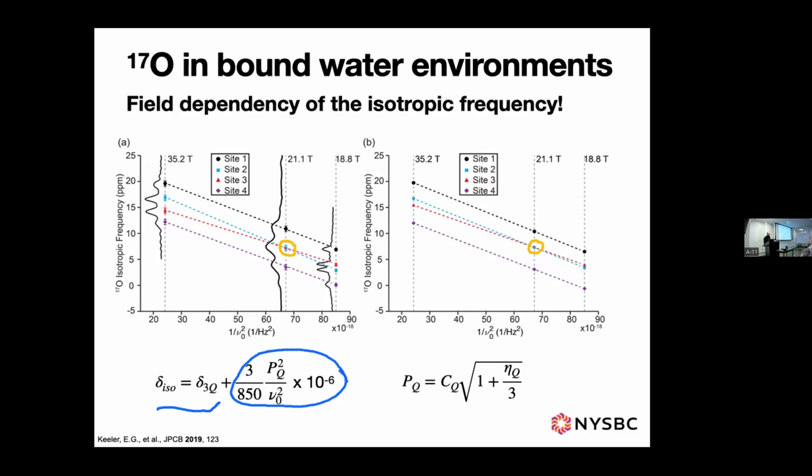I couldn't get it accurate enough. It was because this was on the 900, a standard bore probe with a flip angle stator. So with the difficulty in getting an accurate enough magic angle, I couldn't get the experiment to give me better spectra than the MQMAS. They're far broader isotropic shifts.